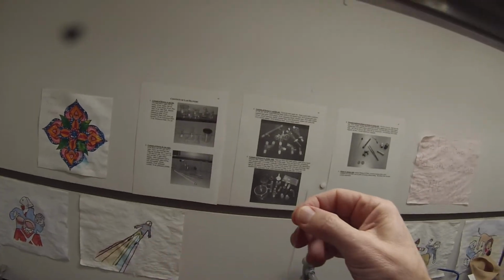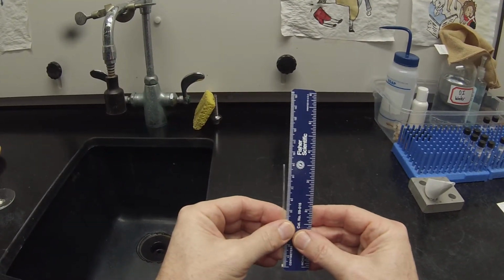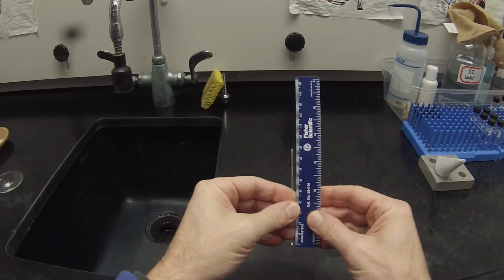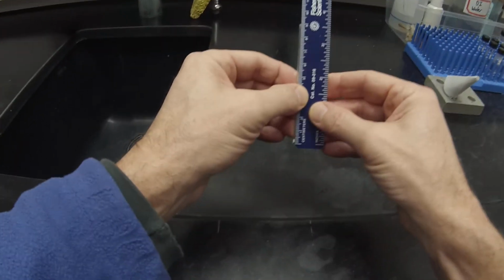So that looks pretty good. Could actually measure it. And it's almost exactly 3 millimeters, so that's good. That's about right.